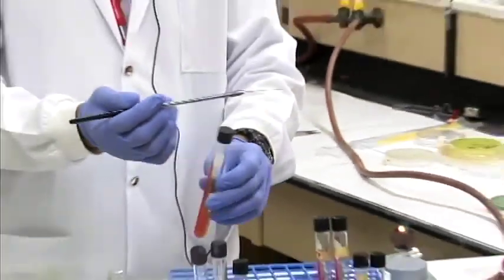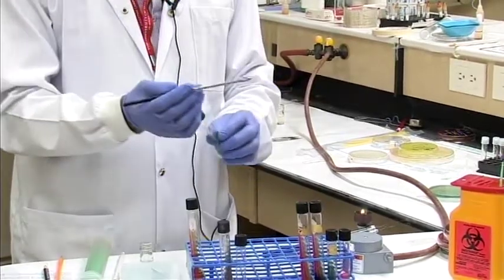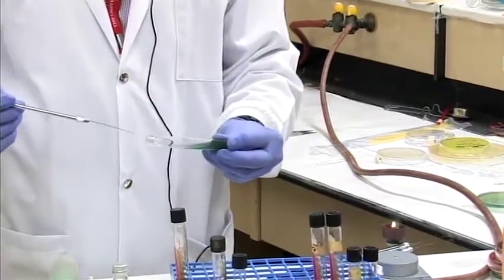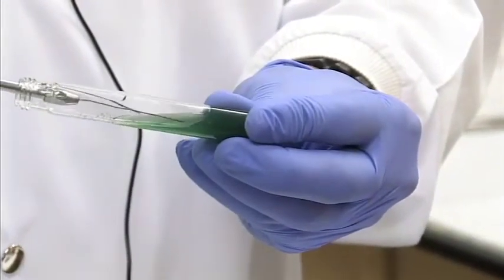Cap again, flame and cap. Without going back to the bacteria, there's still bacteria here on the straight wire. We go on to our next tube, called the citrate. Again, straight down. This one we don't stab, we just streak. So we're just going to streak this slant.